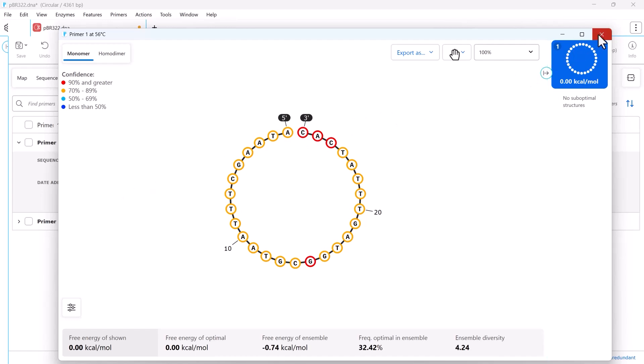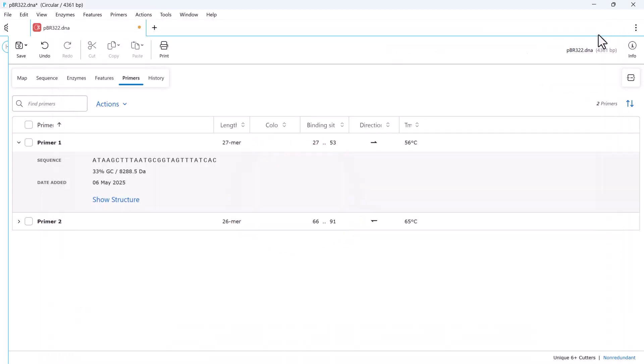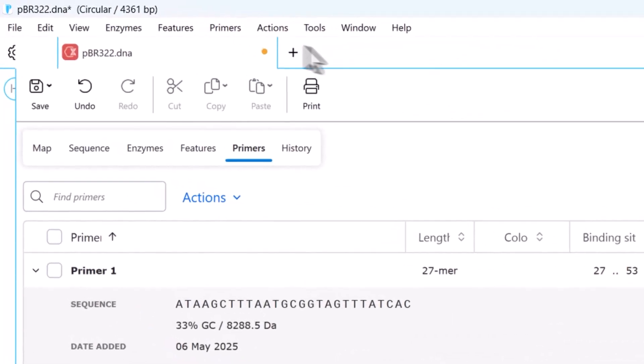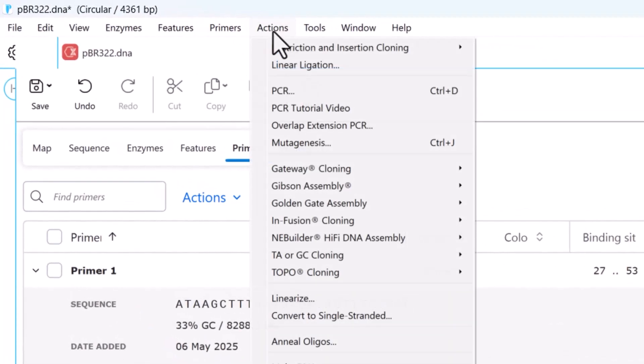SnapGene can also automatically design primers for specific cloning techniques via the Actions menu.